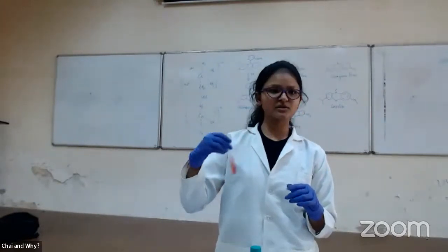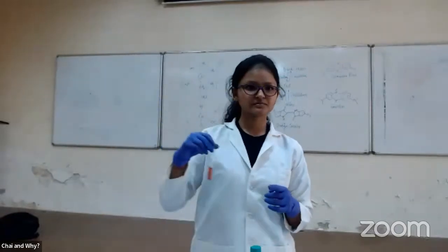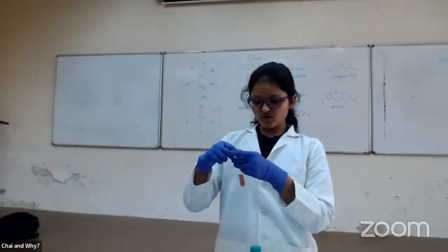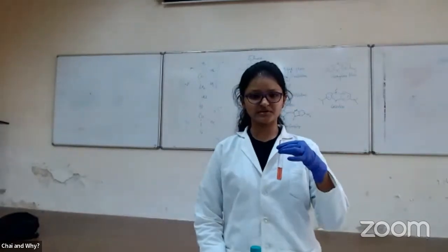Is the color visible on the camera? The audience here can see, right? Yes, I think it's quite visible. You're holding it against your lab coat, and it's visible that it's pink. Audience, can you see, online audience? Can you make out that it's a pink color? Yeah, so here it is.